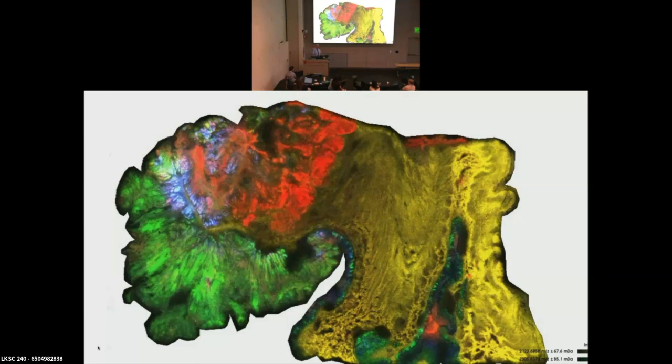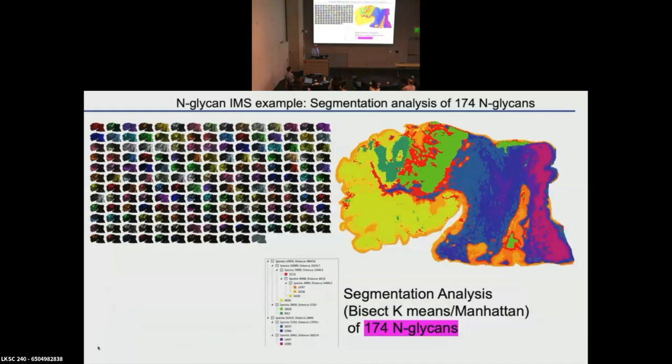The glycans have always been spatial, extremely spatial, and there's nothing random about where they're showing up. In this case, especially with a colon tumor, there's 174 individual glycan species. If you start layering in fucose isomers, there's 1,000 things on here. When you get branches, it's just endless. But the core structures are very robust, and they segment beautifully.